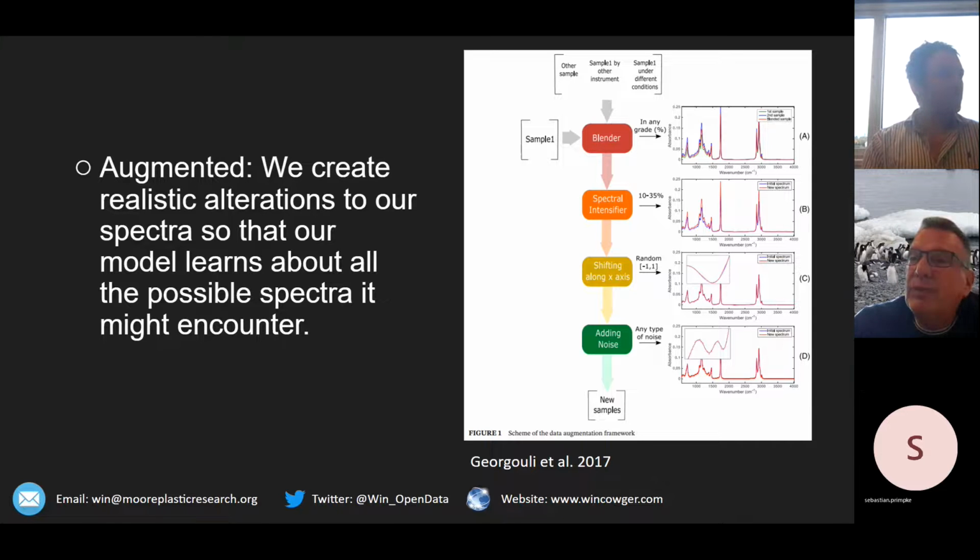We maybe have to talk about it, because Laura is not here, but we had some bad experience with the Anodisc. Okay. I mean, wasn't that just because you use material. Yeah, oh sorry, Nina. Yeah, but they're so brittle.